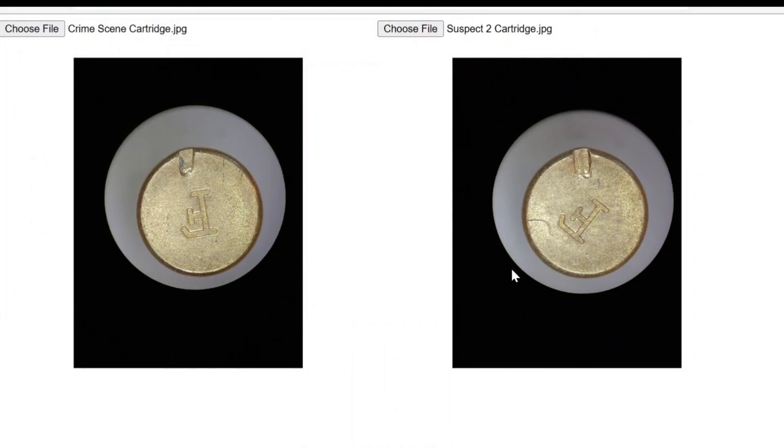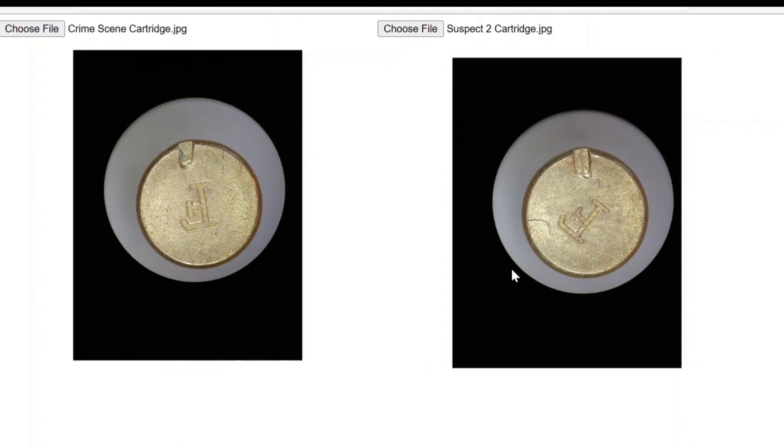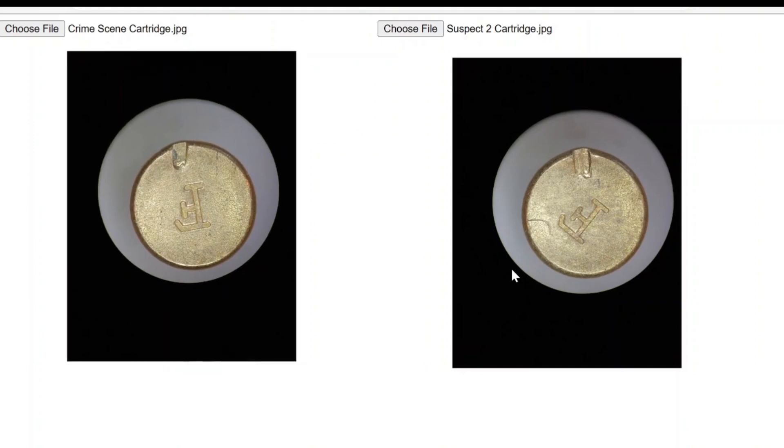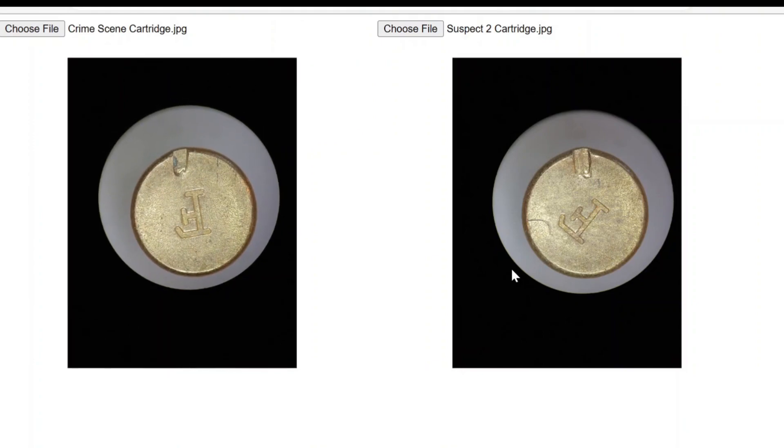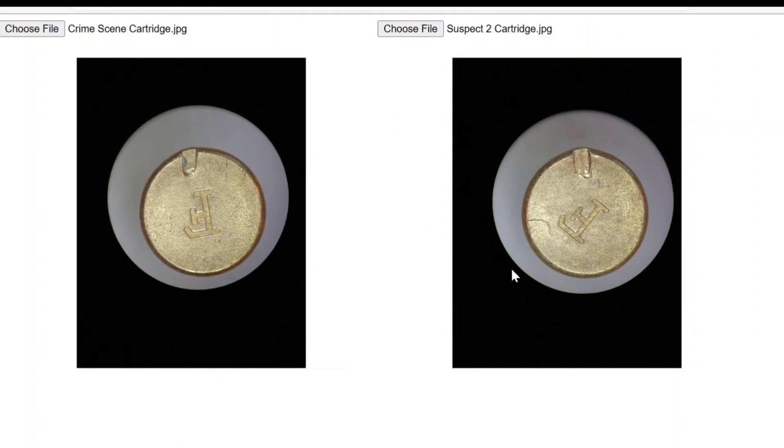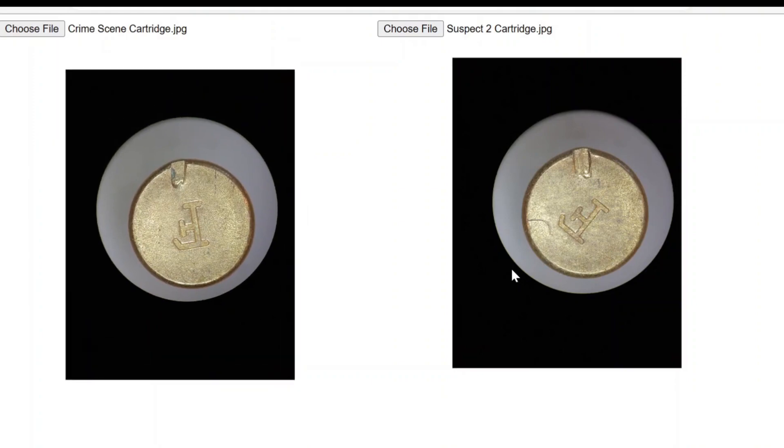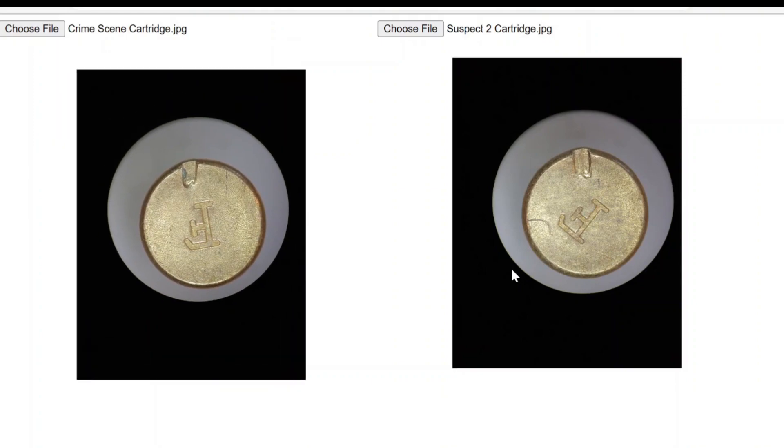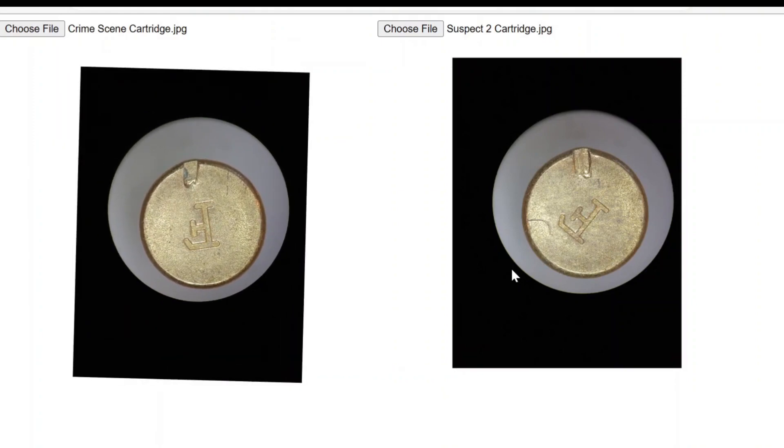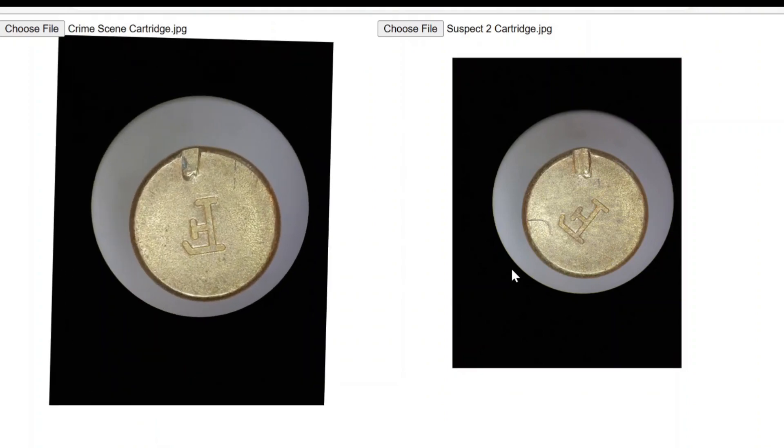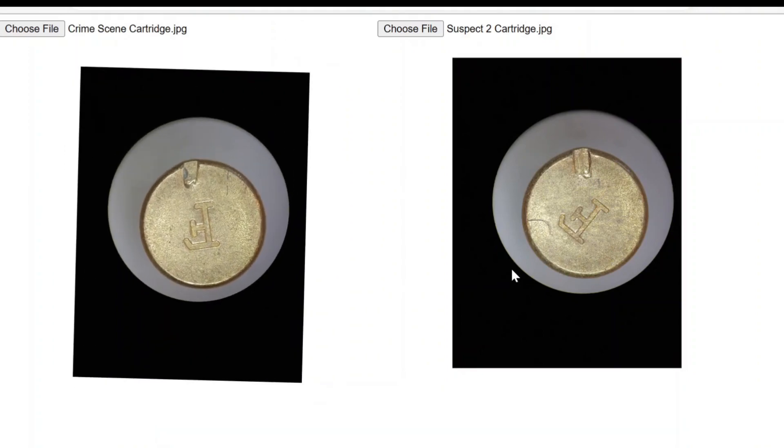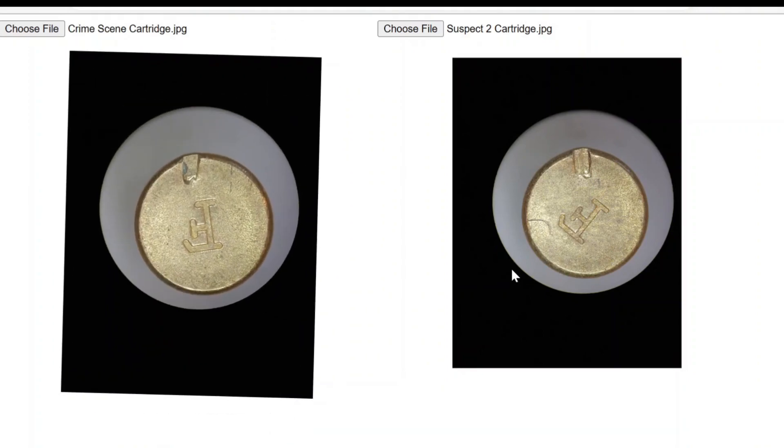So now if I want to move the left image, I just use the W, A, S, D to move it around. If I hold down shift, you will get larger movements. Q and E will rotate it. Again, if you hold down the shift, it'll rotate it more. And then Z and X for zooming in and out.